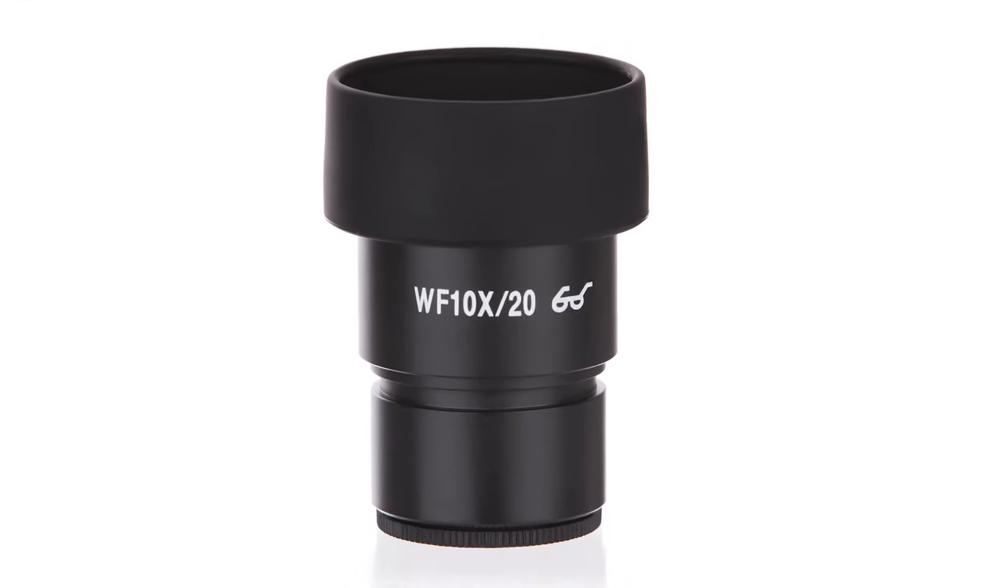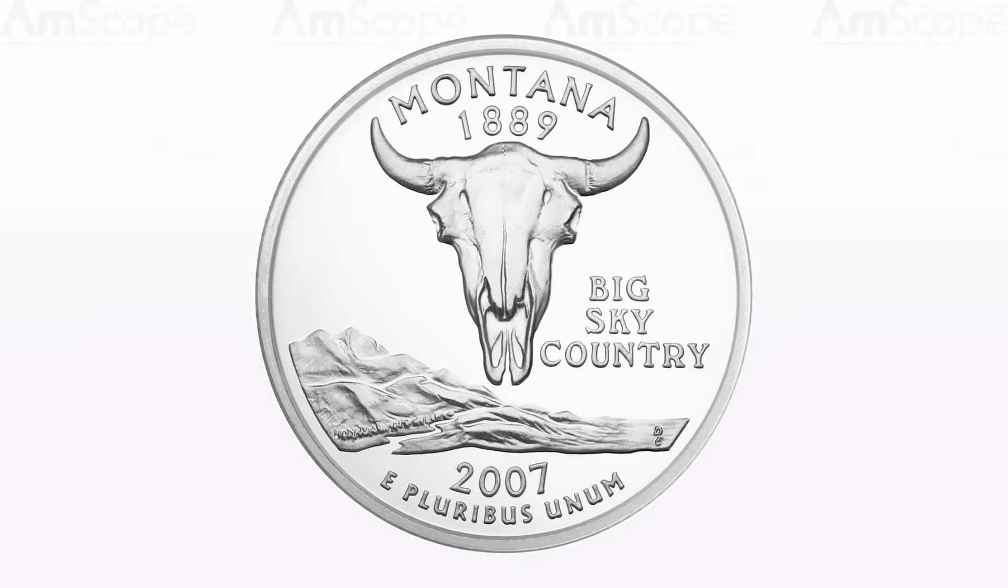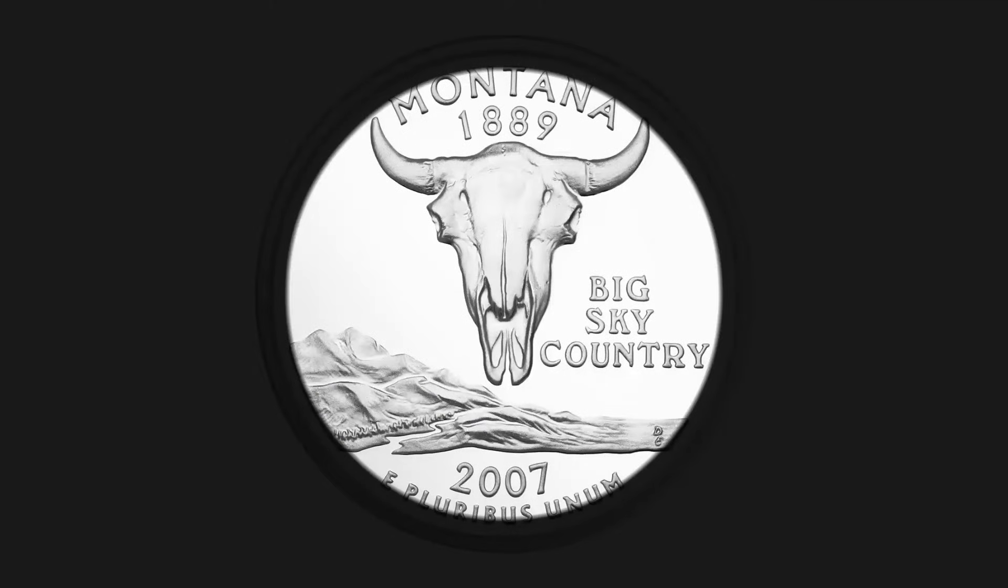Your eyepieces will be marked with two numbers. The first is the eyepiece's magnification. The second is the field number, which represents the eyepieces' field of view in millimeters. In cases where the objective lens produces an image circle smaller than the eyepiece's field number, that image circle would be the field of view.